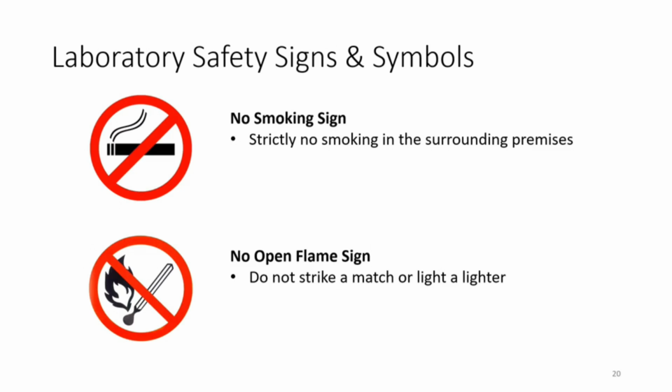These two signs show that smoking and open flame from match or lighter is not allowed in the lab because there could be flammable substances in the laboratory.